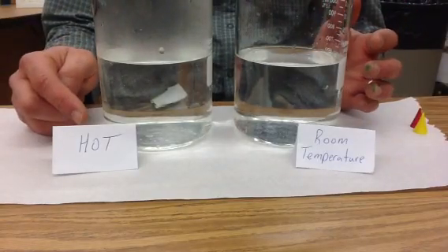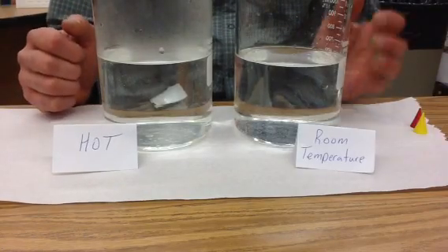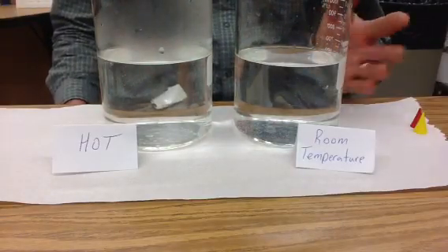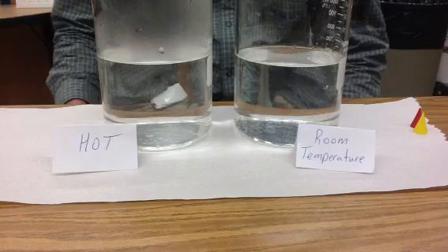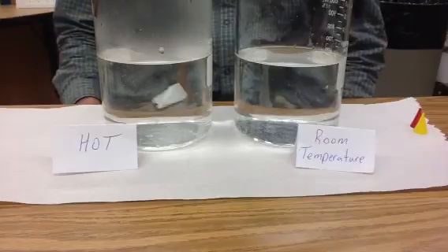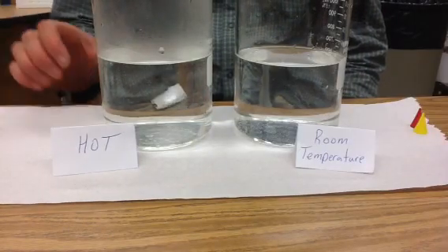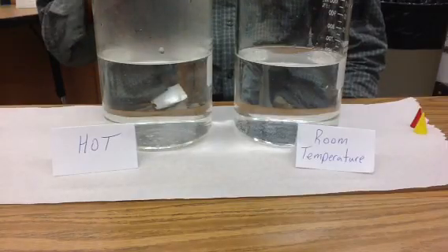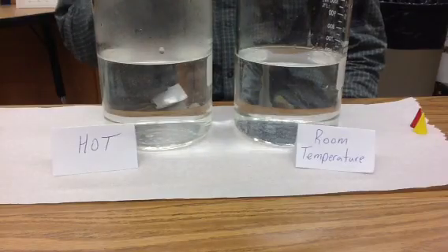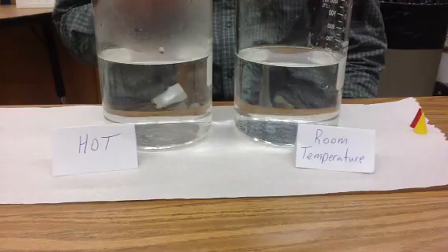I heated one up just to make it a little more interesting, because when water is hot — when you increase the temperature of a liquid — the molecules are moving more quickly, compared to a liquid at a lower temperature. Right now we just have water, and there's no concentration gradient, so there is no diffusion. That means there is no area of high concentration and low concentration, so there are no molecules diffusing from an area of high concentration to an area of low concentration.